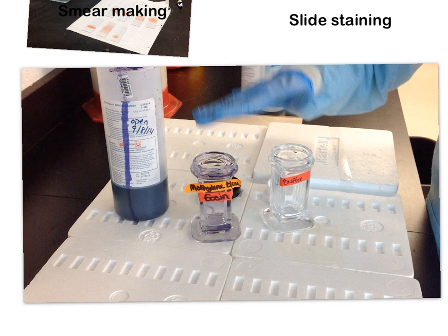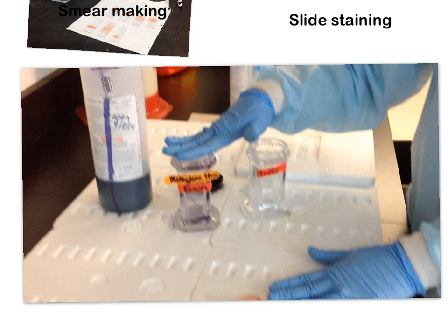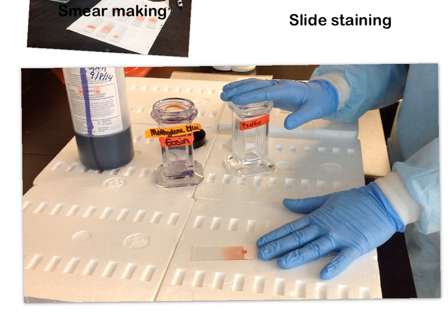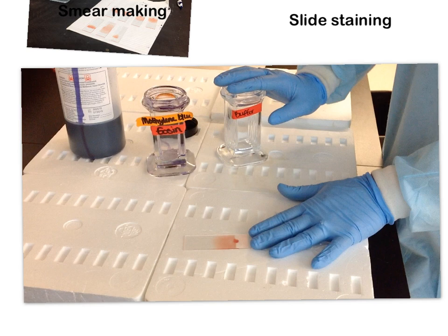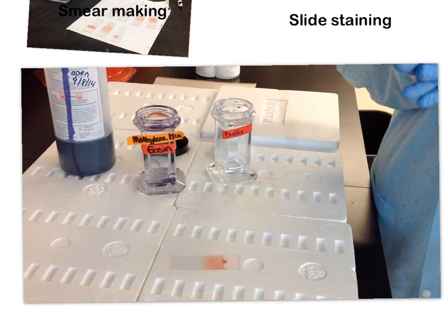When we stain our slides, the first thing we do is make sure we have a nice dried smear. We add it to the stain for two minutes, then put it in a buffer for five minutes. Our smears will have been made from blood collected with EDTA — ethylene diamine tetraacetic acid — our primary anticoagulant used in hematology. Cells are generally good for about 24 hours when collected in EDTA, though this varies by facility.